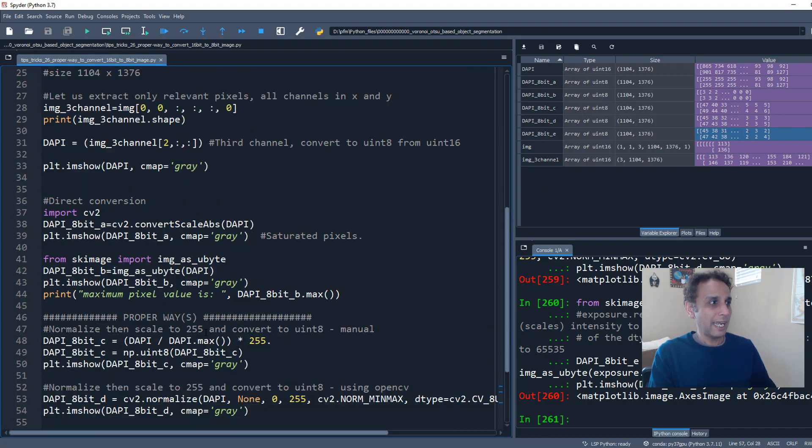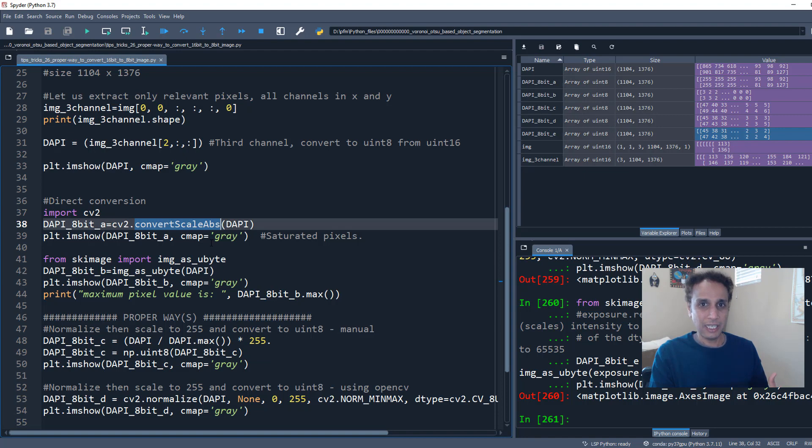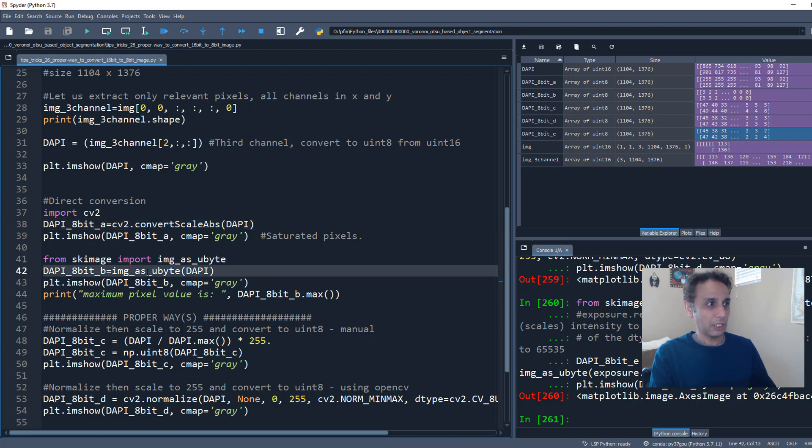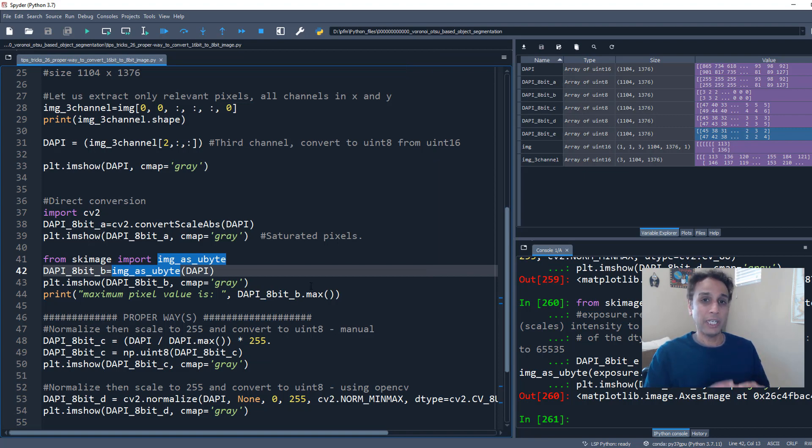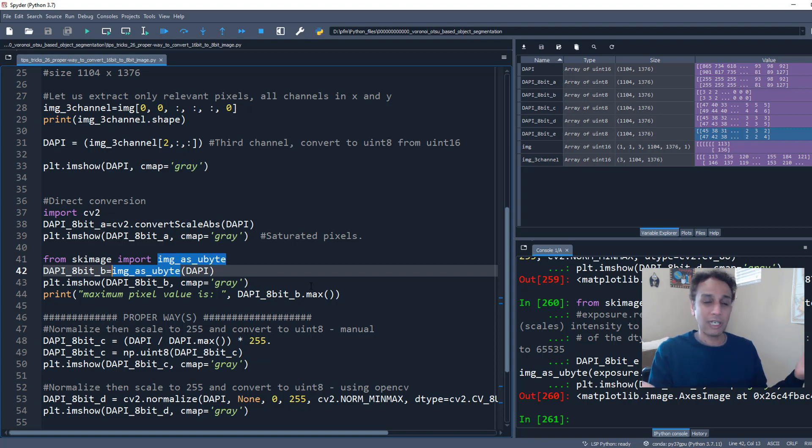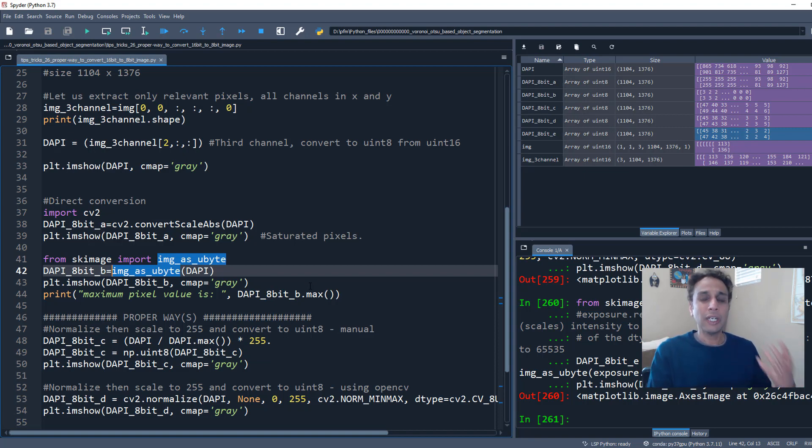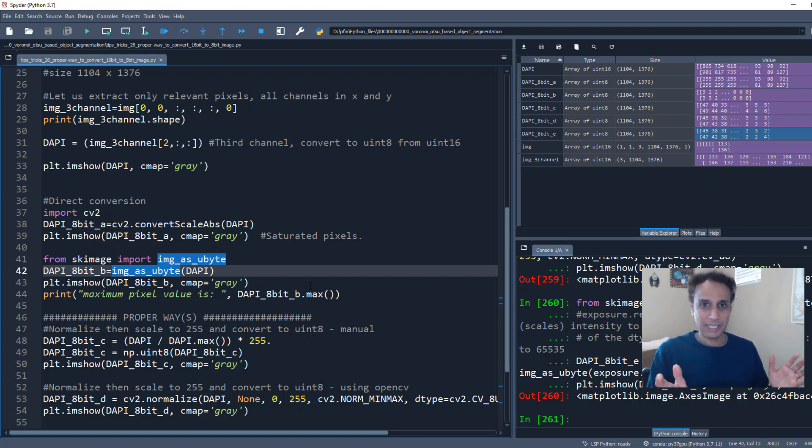Like if you use convertScaleAbs for any of your applications, just see what the implications are and is that okay. And same with converting to image as_ubyte. Like do you need to normalize? If my input image is completely going from 0 to 65,535, then maybe I can just directly convert to ubyte without any normalization. But look at where the information is present in terms of your histogram, and do you need to scale it or not scale it? So please be aware of all of those.